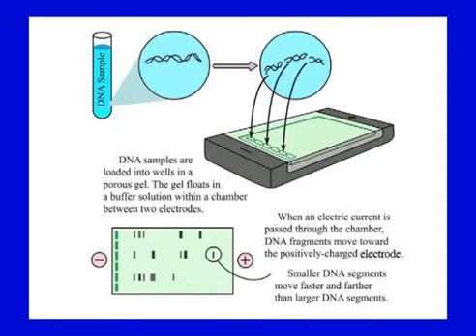So, you will use Tris-acetate-EDTA or whichever buffer you are utilizing, and you submerge the gel in that buffer, that is the running buffer. Here it shows very clearly how this is done. But before this figure, I would like to show you how this whole process is done during the casting of the gel.